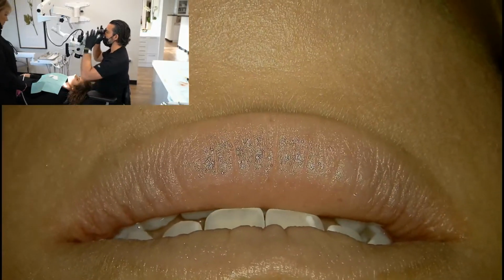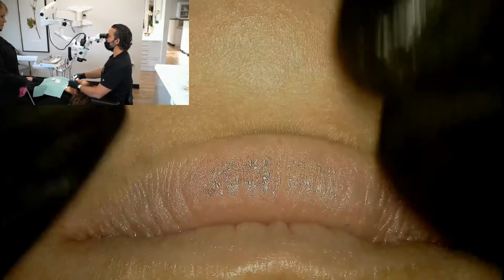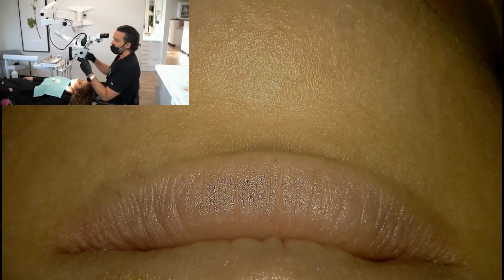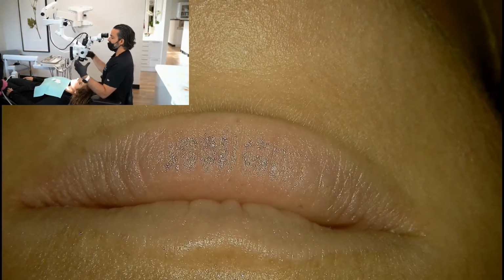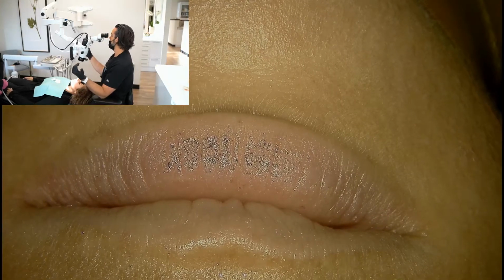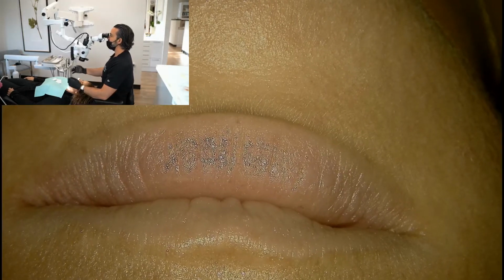One thing is if you have these cups, like I said, it blocks the light and the room around me becomes very small, and I can work. But sometimes you start using your eyes to push things around as you're trying to see, and then you're constantly refocusing. So other people like to push those cups away, and when you do that, you have a little more wiggle room. You feel less tight. Your peripheral vision is opened up. You can look out of the corner of your eye. Your neck's not doing this thing. You can look side to side with ease. And the other thing is then you're not touching your microscope. So when you're at higher magnification like this, then it's something that's.